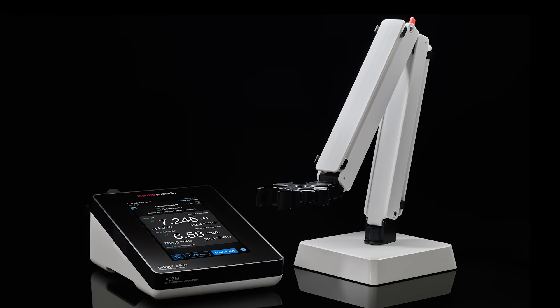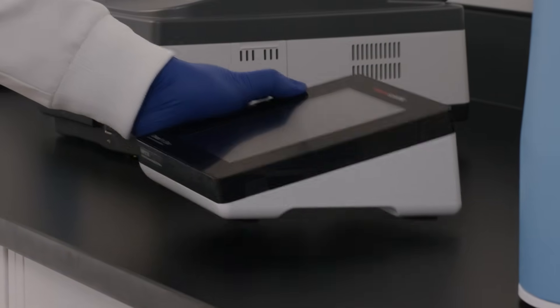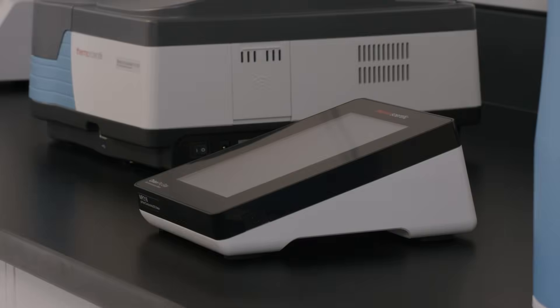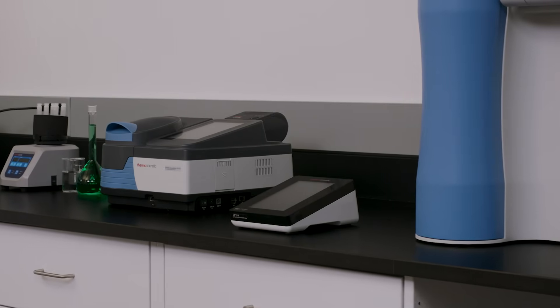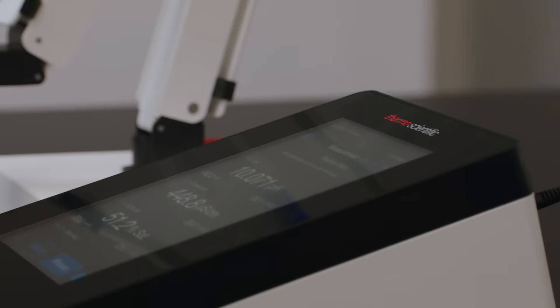Strong as it is smart, the Orion ProStar is built to last. Constructed from durable materials, it is lightweight with a small bench footprint. Rounded edges and smooth surfaces also make cleanup a breeze.